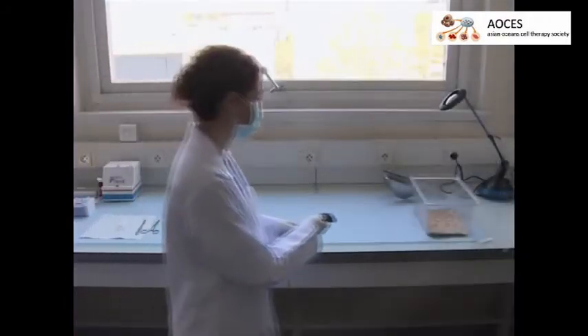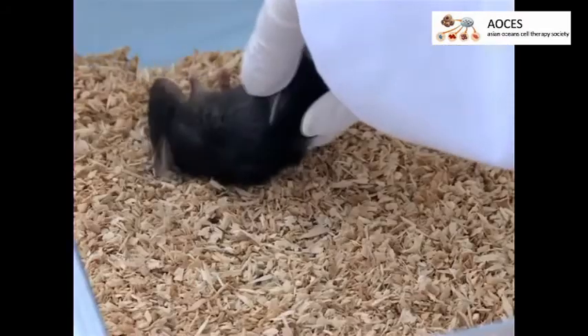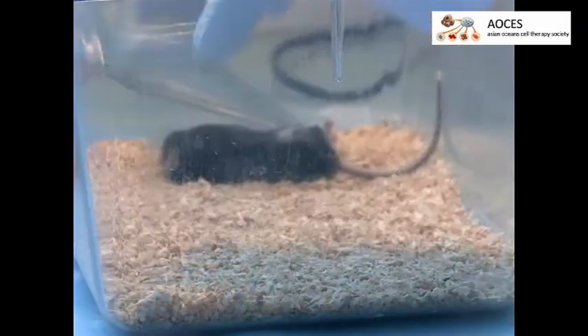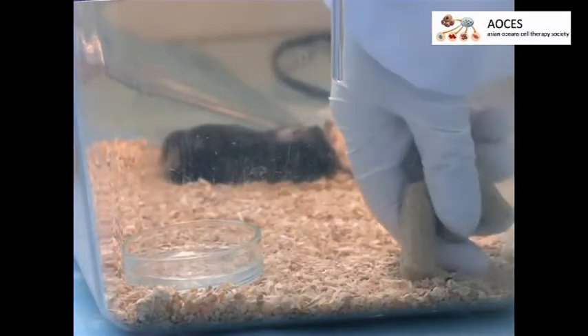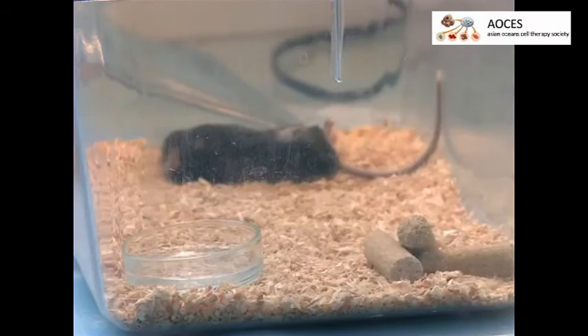Transfer the mouse to its clean home cage, setting the mouse on its left side. Keep it warm with a heat lamp until it awakens. Add extra food and water in the cage so the mouse can nourish itself.